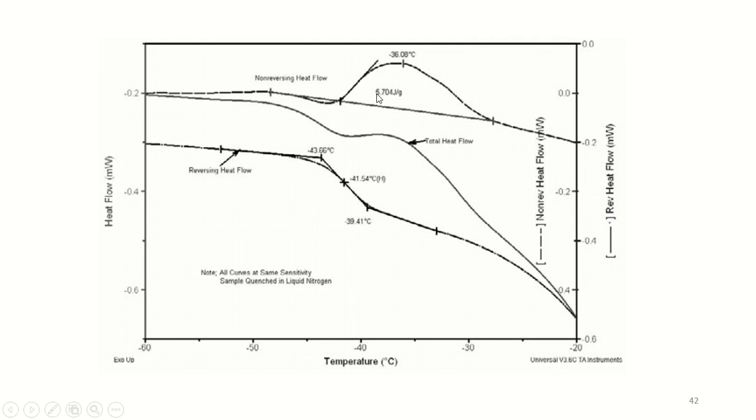It is not surprising that unfrozen water would begin to crystallize near minus 42 degrees Celsius, since this is near the onset of the glass transition where a significant increase in molecular mobility and diffusion can occur.